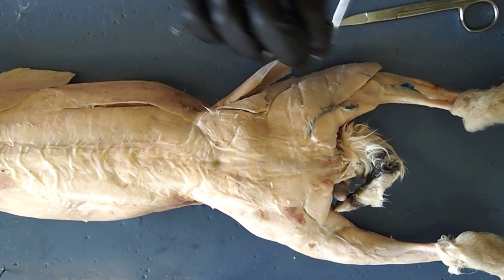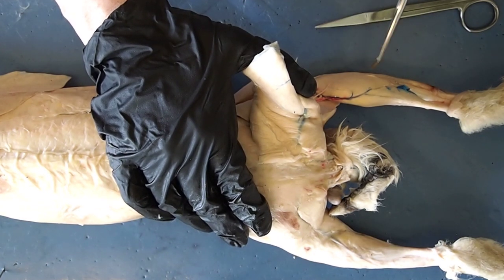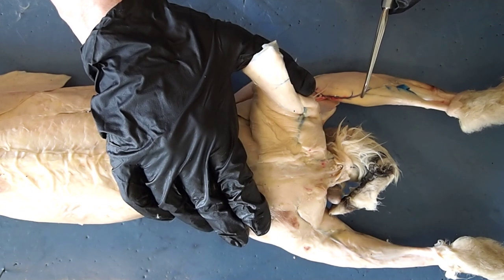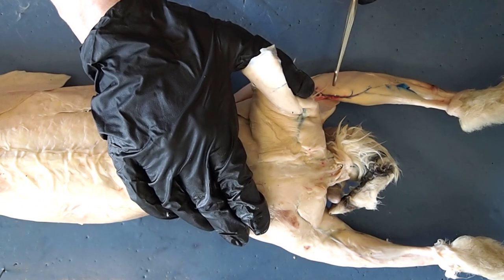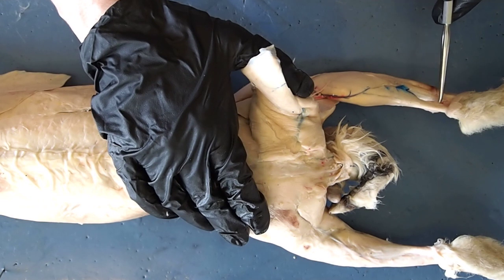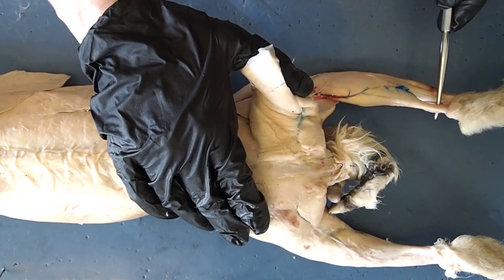Moving down to the lower part of the leg, I want to draw your attention to this very large muscle here — this is your large calf muscle. The name of your calf muscle is the gastrocnemius. The gastrocnemius is going to stabilize your lower leg and aid in walking and running. As you move down the gastrocnemius, you'll find this elongated tendon. Tendons connect muscles to bones, and this tendon is your Achilles tendon.